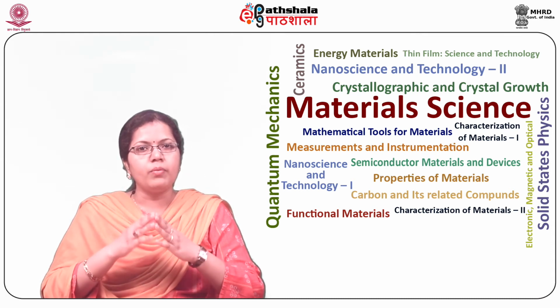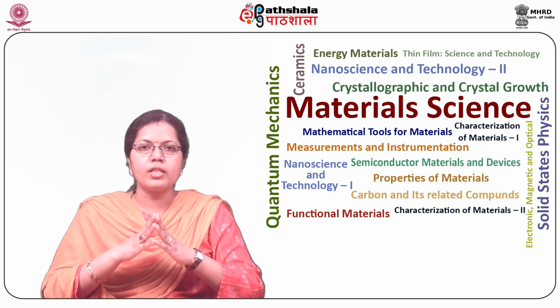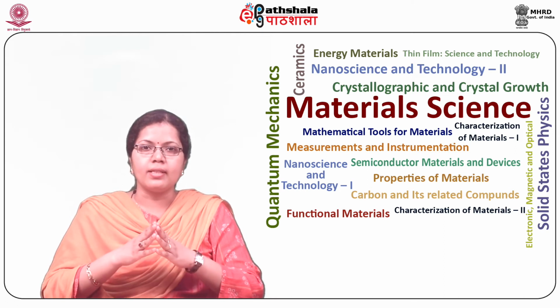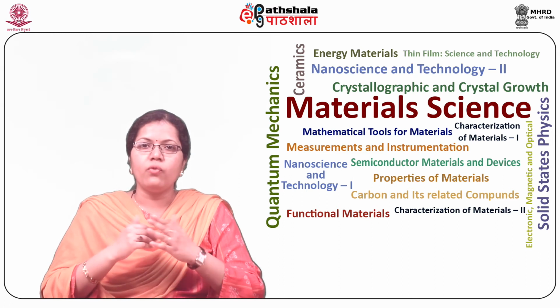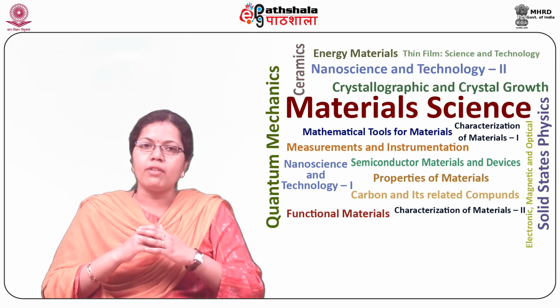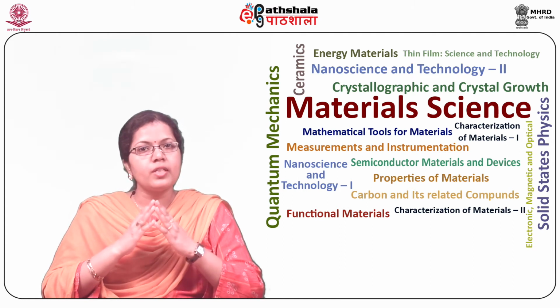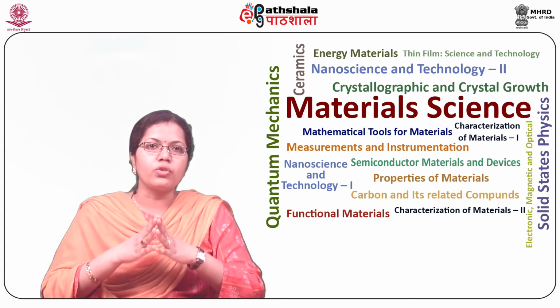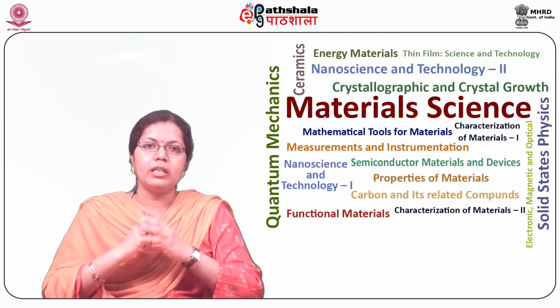If the components in the mixture exhibit no distinguishable morphological features and also possess very slight difference in the refractive indices, these components appear very similar via conventional microscopy techniques. Dispersion staining in this problem can be used to differentiate them by forcing them to assume different colors.